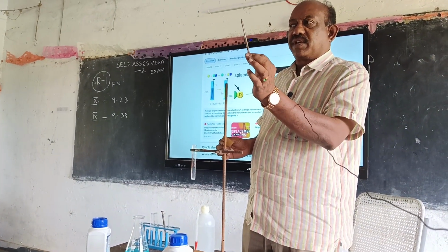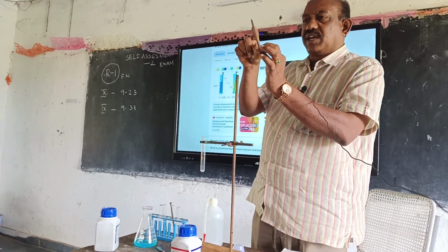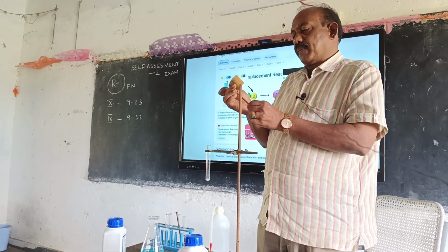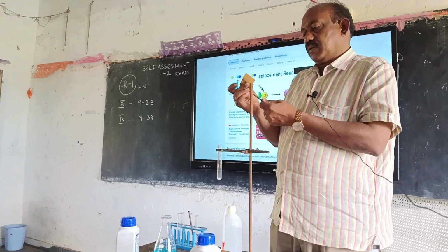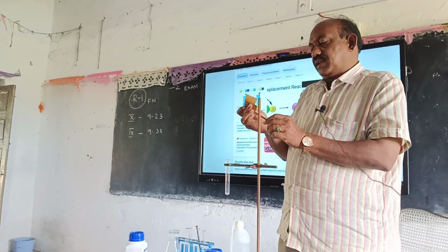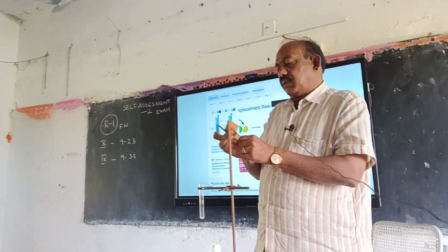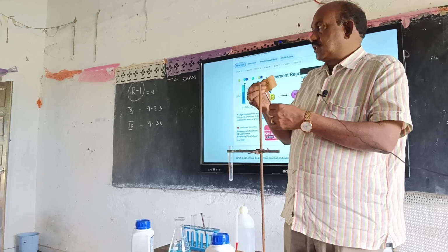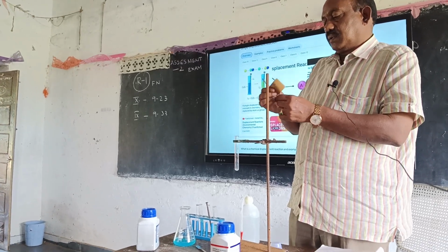Now you will find the difference. What is there? Some rust is there. So that's why if you rub the nail, the rust will be removed. Then the reaction will start fast.